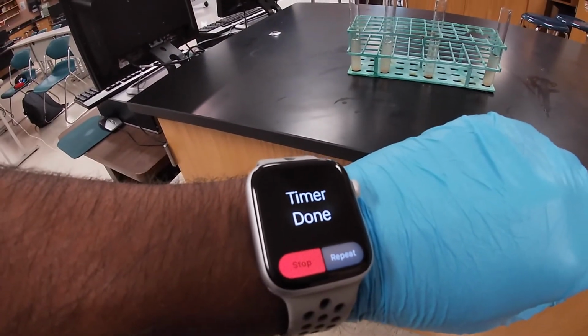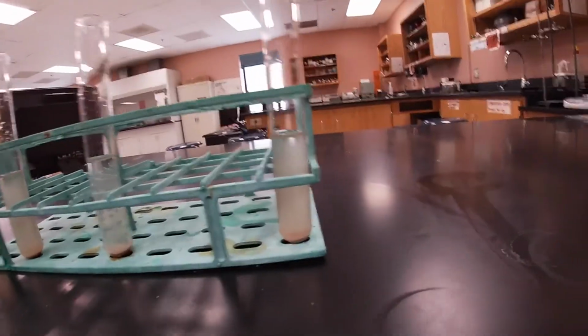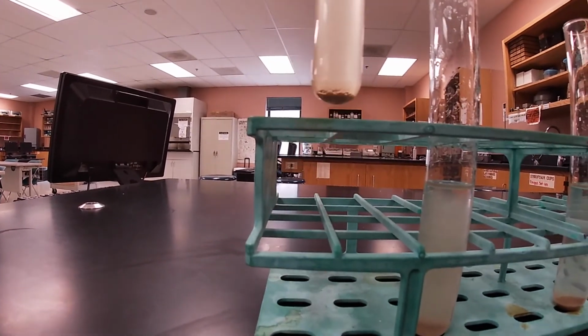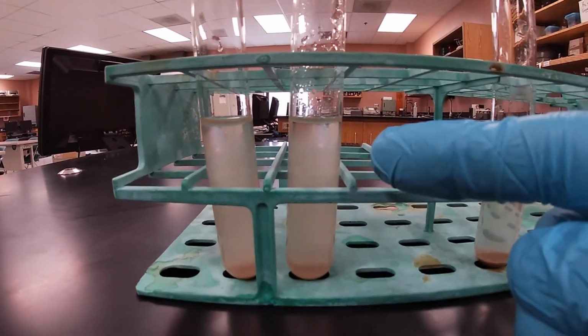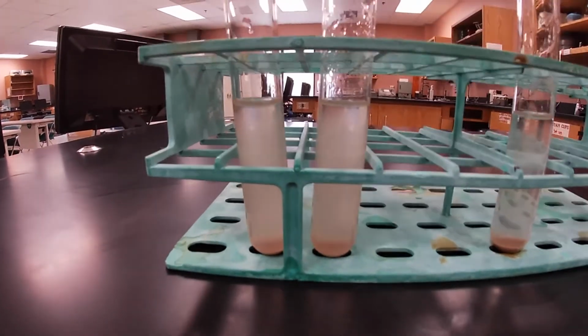So after the 30 minutes are done, we're gonna check our four again. If you notice, this one is our standard with water, and this is the sodium chloride one. Not much of a change has happened.